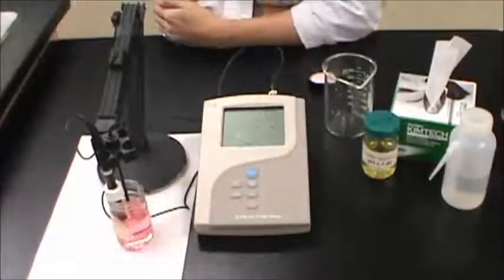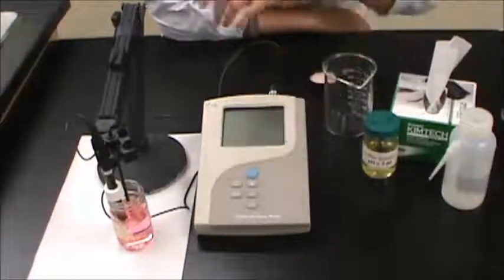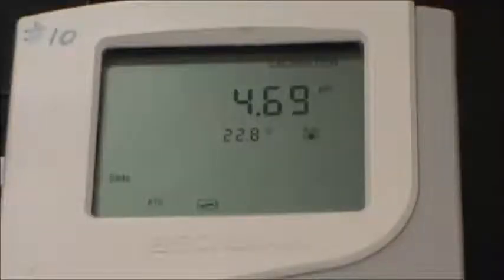Let the probe sit in the solution for approximately one minute before pressing the read button. The correct value for the pH buffer solution you are using should eventually appear on the screen.